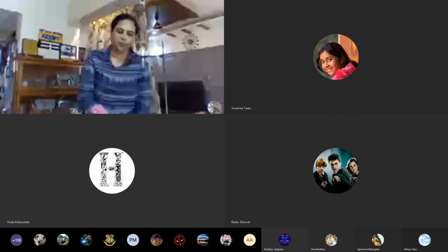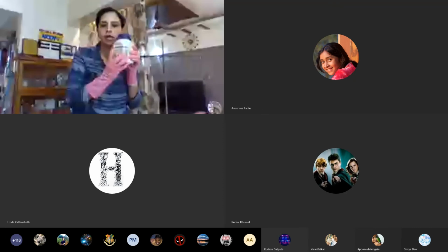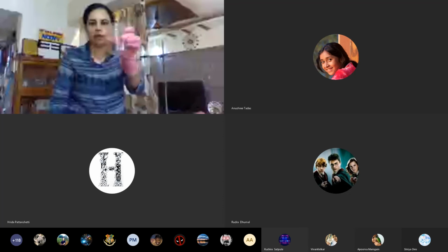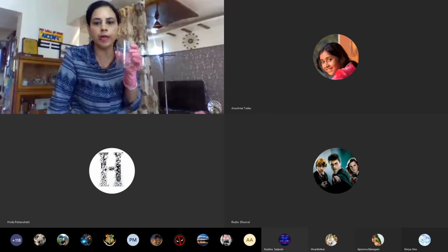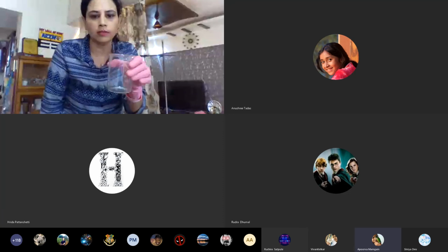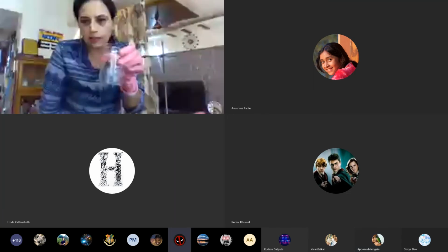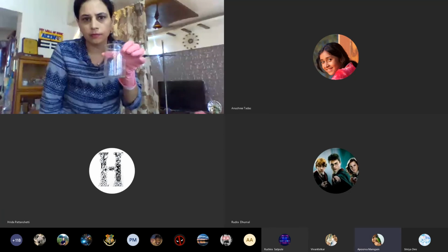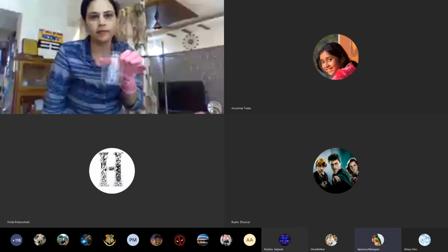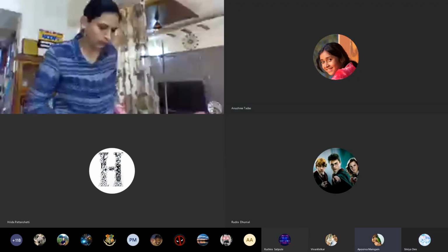Okay. So the first thing, now what I'm going to do is remove some sodium from this and put it here in this beaker. Okay, and I will not bring this very close to my laptop because it might damage my laptop also. So this distance is fine. Is this distance fine? Yes, ma'am.